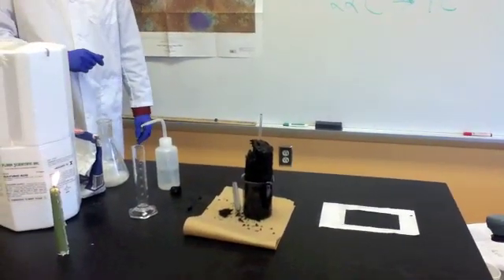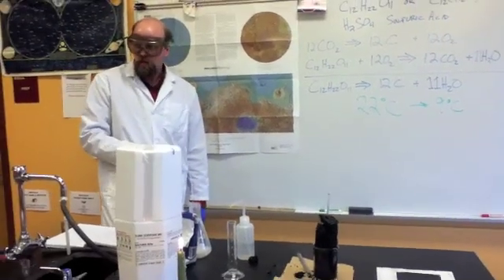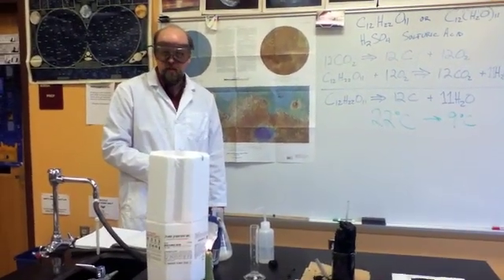So there you have an example of another exothermic reaction. Some people call this the carbon soufflé reaction and it's very impressive and a lot of fun to do.